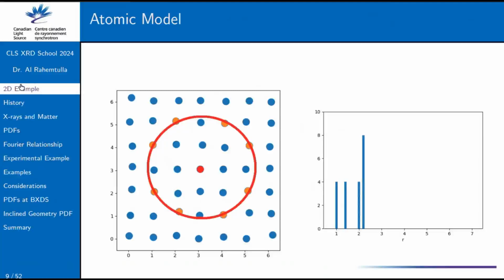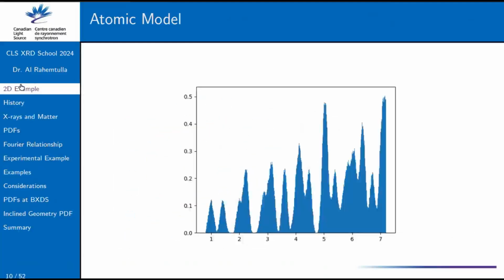So I ended up expanding this into like 100,000 atoms. With those random variations, I made tiny windows and did all that math for you. And we get something like this. So again, we start seeing that same form that we saw before. There are going to be some widths to these peaks due to all that random disorder that I tossed in there.